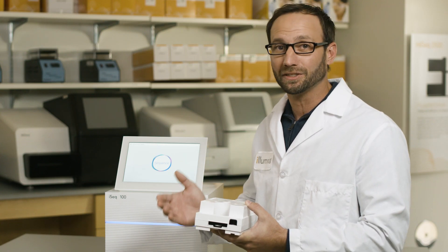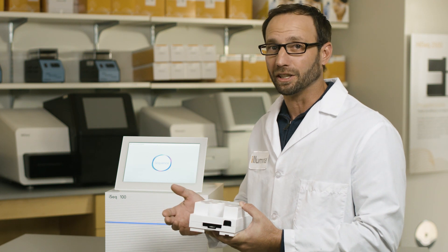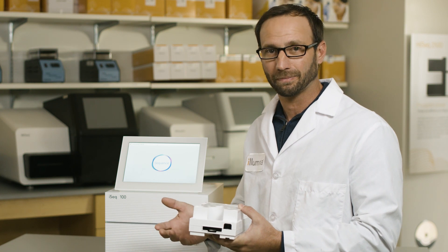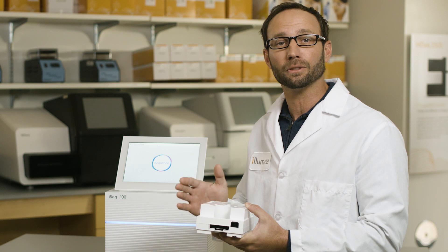Setting up the prepared libraries is very similar and just as easy as our other benchtop systems. The reagent cartridge and flow cell both contain a unique RFID, making tracking of consumables more convenient. There's no longer a need to use a barcode scanner for the information to be entered into the run setup screen.